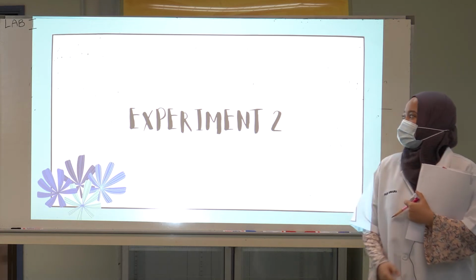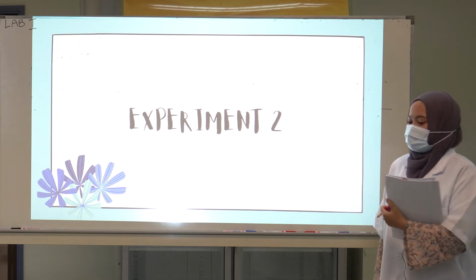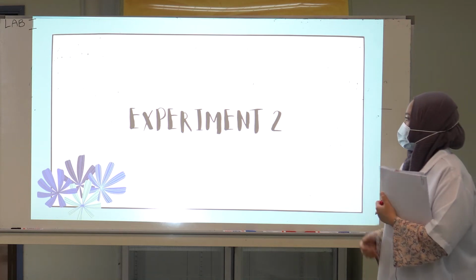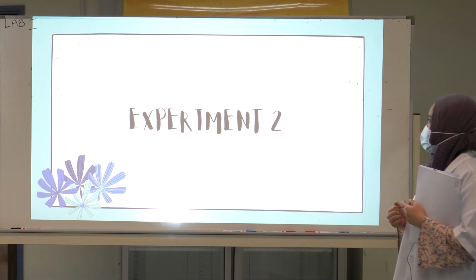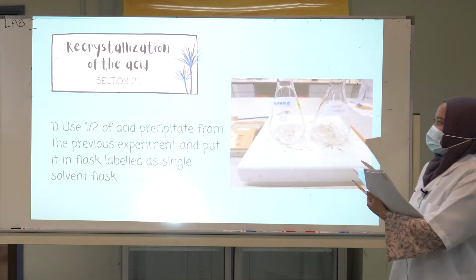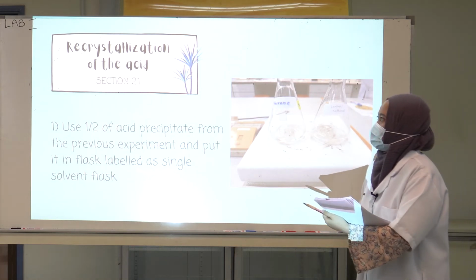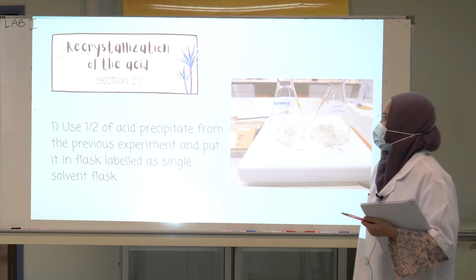Assalamualaikum. My name is Fatih Humaira binti Muhammad Fairuz, and I am Akil's lab partner. And today, I will cover the second part of the lab experiment. Okay, the first part of the second experiment is a recrystallization of the acid.